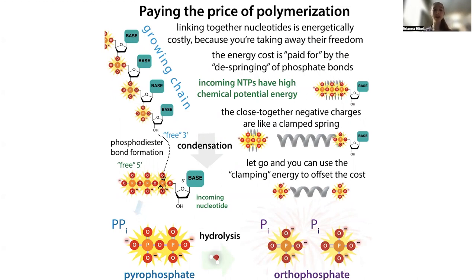This 3' OH is what attacks the incoming nucleotide. With the phosphate groups, this provides the energy needed to form this bond. So the key thing is that we have a 3' OH, we're able to form a bond to an incoming nucleotide, and this releases phosphate groups. This is the same sort of reaction that we're going to rely on in our sequencing methods.